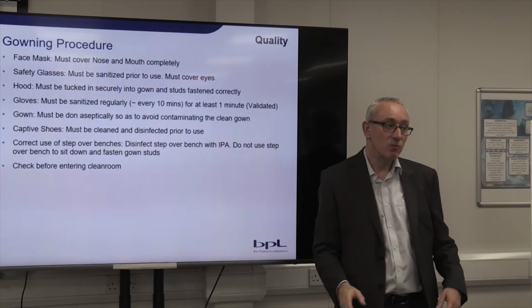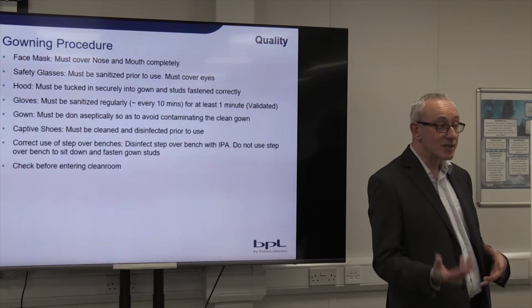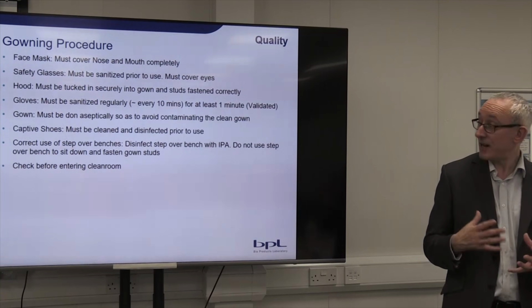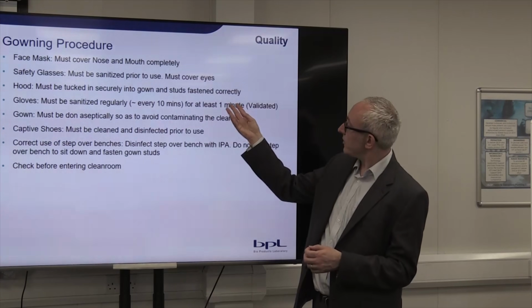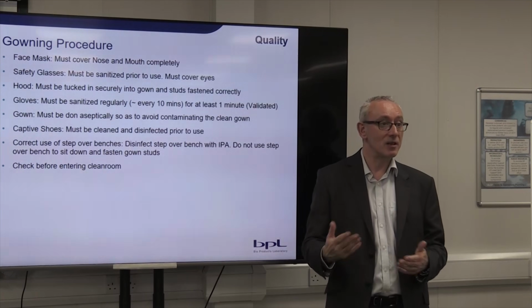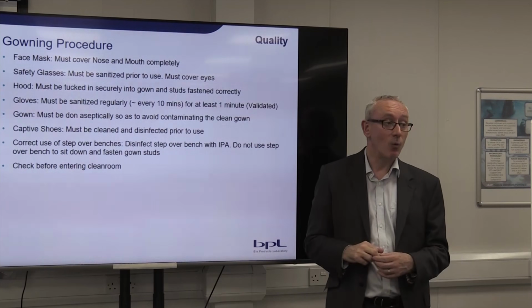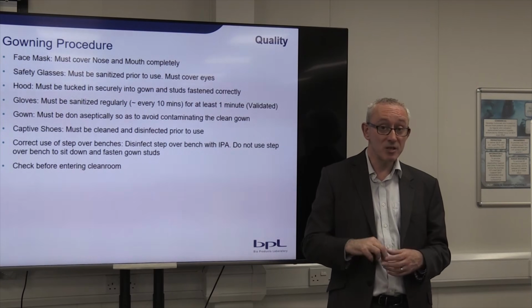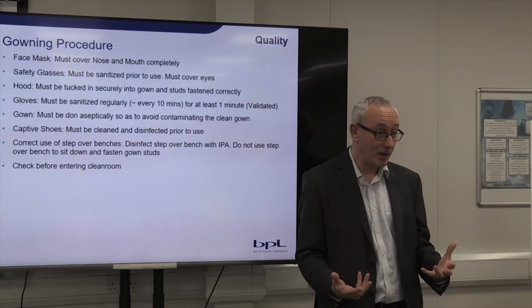Gloves, so in areas where you're required to wear gloves, it's good practice every 10 minutes to undergo a hand sanitisation exercise. The way of doing that, which I think there's a demonstration coming up shortly, is for at least 1 minute, which is again a process that's been proven at BPL.